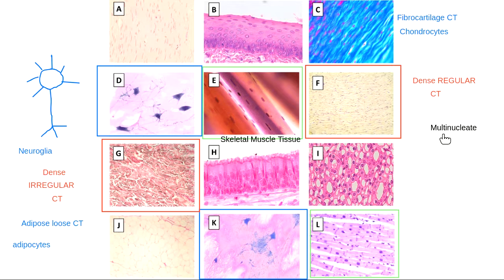So remember, skeletal muscle tissue we looked at on the previous slide. You can see those striations really well. Or if we're seeing this version of skeletal muscle tissue, your big tip-off is going to be all these nuclei that I see. I like to jokingly call them the ants on the log. So if you see ants on a log type of tissue with all these little ants that are crawling on the log, we're looking at skeletal muscle tissue.